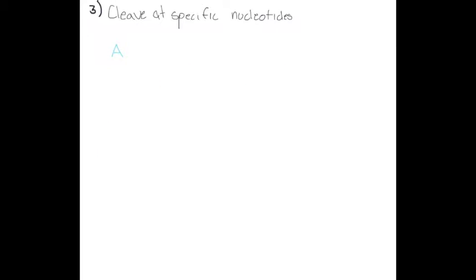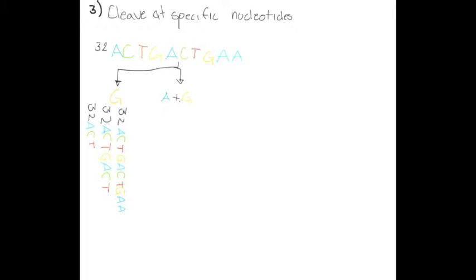Different chemicals change the composition of nitrogenous base at specific positions. This change will weaken the bonds between the bases and the sugars, creating a break. In purines, adenine and guanine, dimethyl sulfate will attack by methylating a nitrogen atom, making the bond unstable, which can be broken by increasing heat. An alkali solution will break the sugar from the phosphate group. Brightest band in the electrophoresis will indicate when guanines were broken, and light bands will tell when adenines were broken.